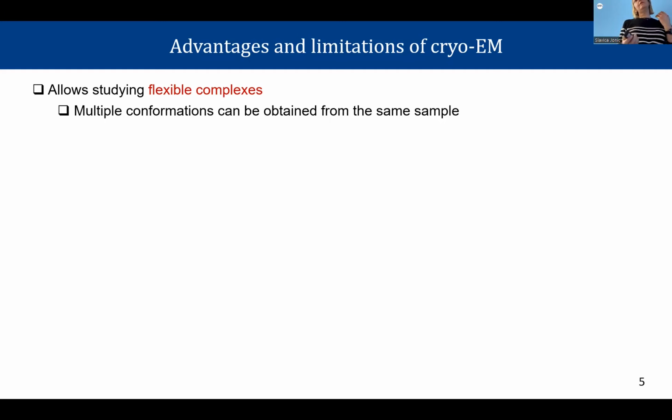As I said, we speak about purification, and you could imagine that you extract these proteins from a cell, but very often this is not done like this. They can be really engineered, producing them in bacteria, so in some environments they are probably better controlled.